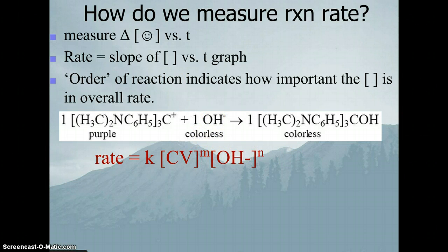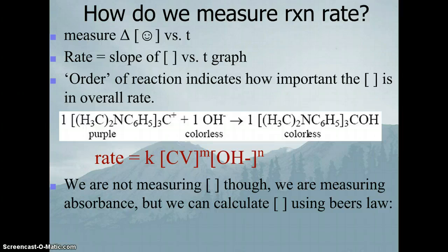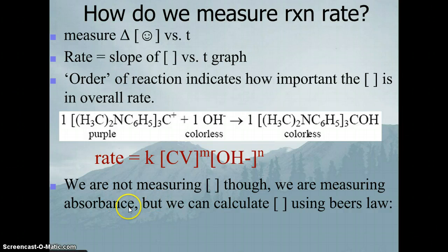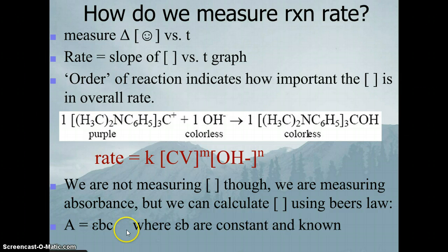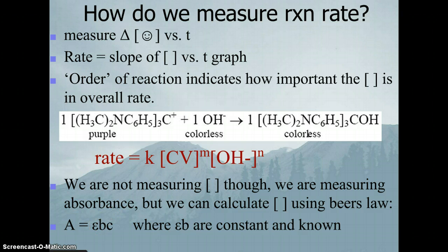The only way we can determine what M and N are is by experiment, and that's what we're doing in lab. Normally we measure concentration directly, but instead we're going to use our spectrometer and measure the absorbance of our reaction solution. Since we know the molar absorptivity of crystal violet and the path length — the Beer's Law constants — we can run the reaction, measure absorbance versus time, and then convert it into concentration versus time.